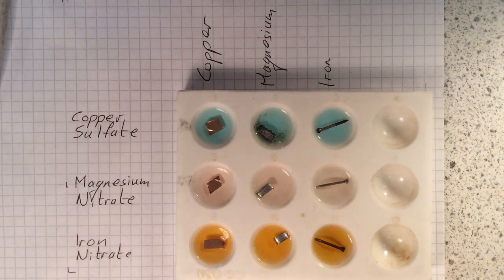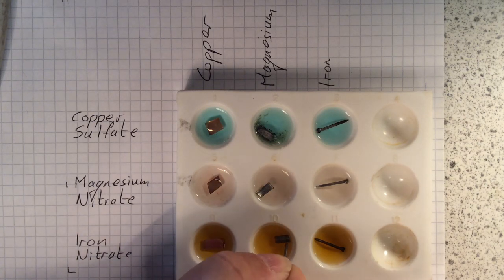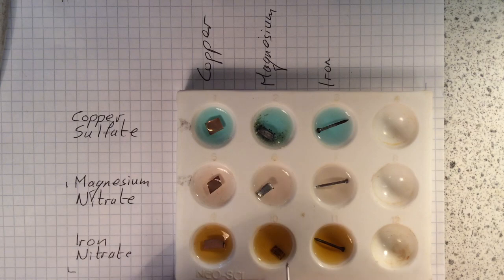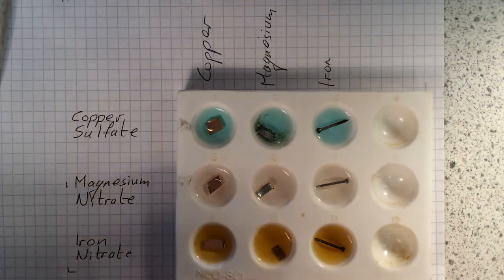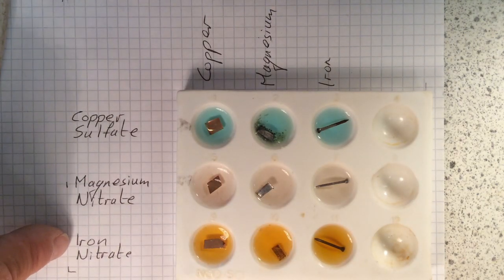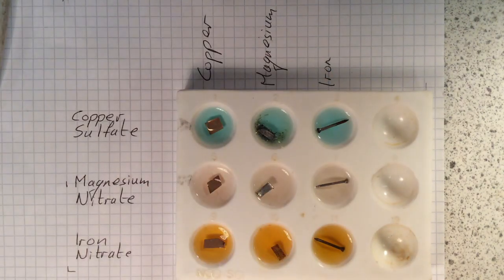Iron and magnesium. So there is iron nitrate here. So the iron is hanging on to some nitrate, and then the magnesium comes along. Now, can't see it too well, but there is a reaction happening there. There's a change of colour that's gone on there. You can see it on the other side. The magnesium, just pure magnesium, is a nice silvery colour, but this has changed colour because the magnesium is now winning in the battle with the iron over who gets the nitrate. And then the iron and the iron, nothing obviously happens with those because that's fighting against themselves.